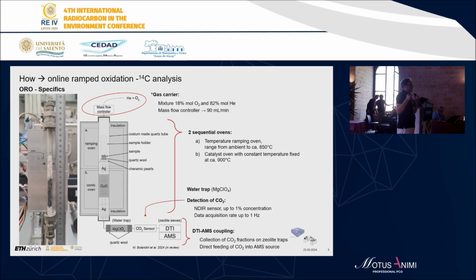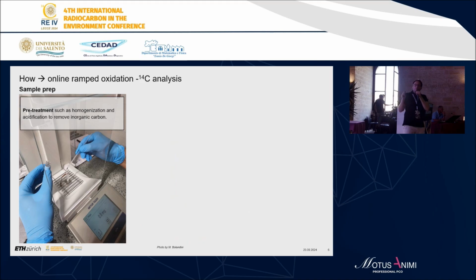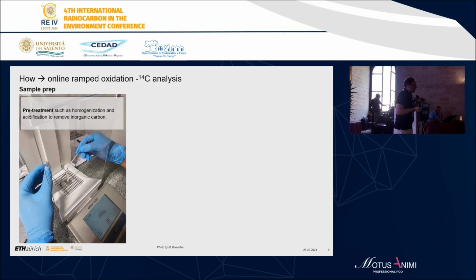Clearly, I'm more interested in the organic matter, not the inorganic carbon, so we usually remove it by fumigation.